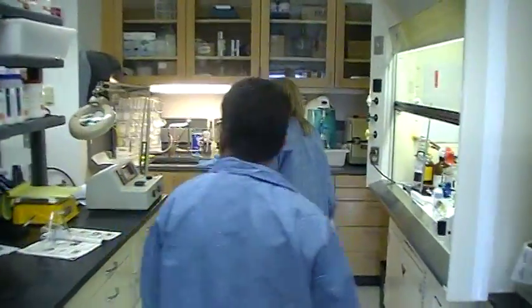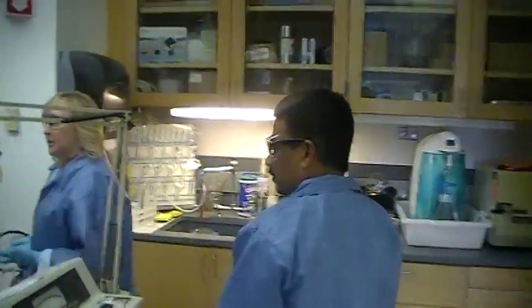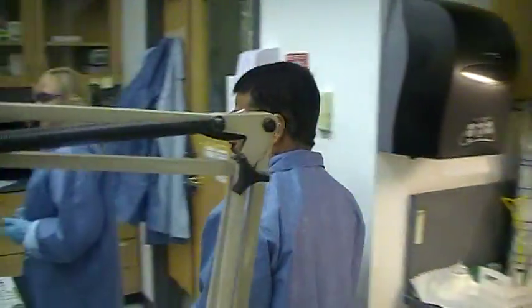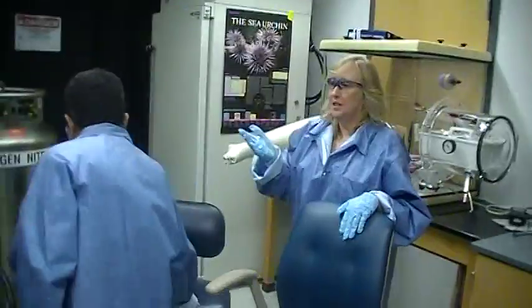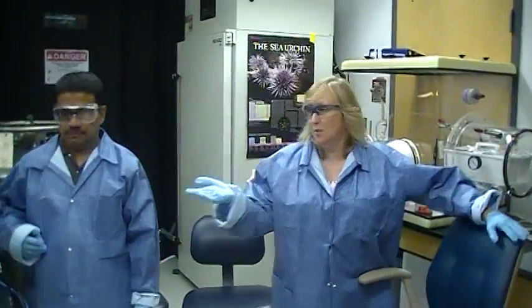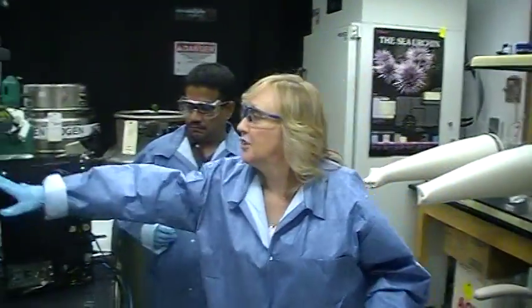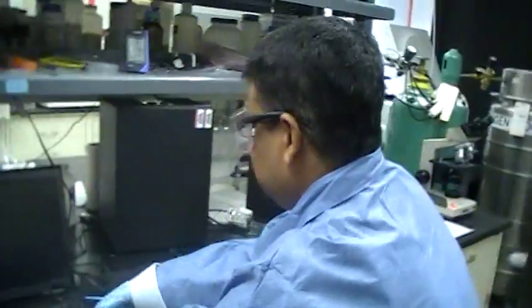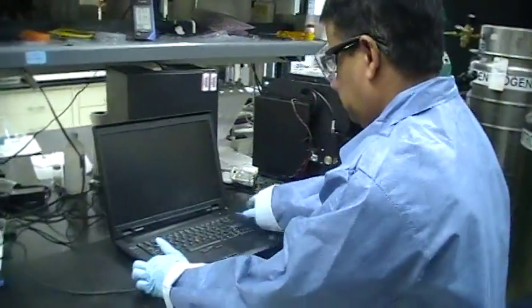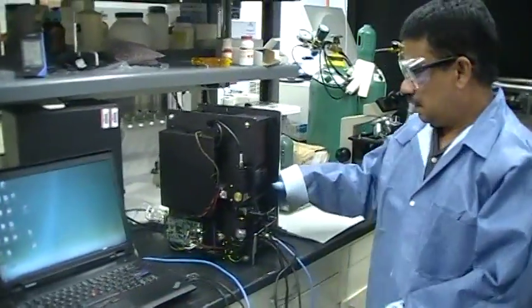Now we're going over to the other part of the lab, which has the portable Raman microscope. The beauty of this is that it's so much lighter — it actually gets sealed up so that it's portable. It has handles so you can bring it to the doctor's office. Less expensive, lighter, user-friendly.